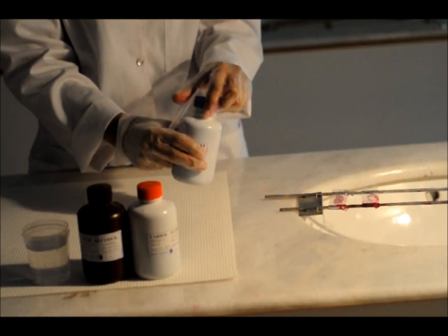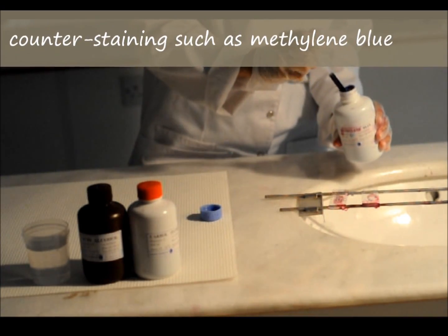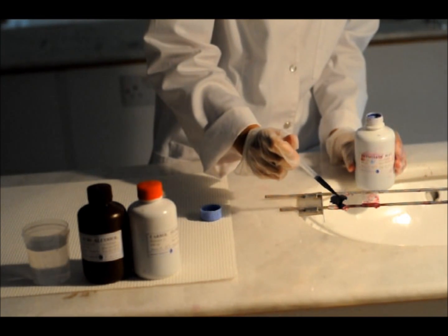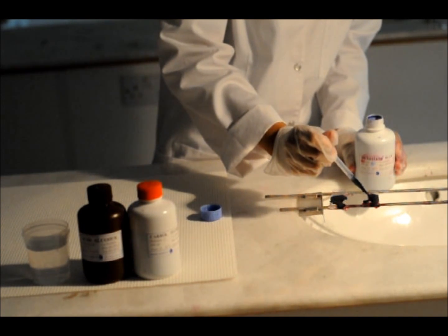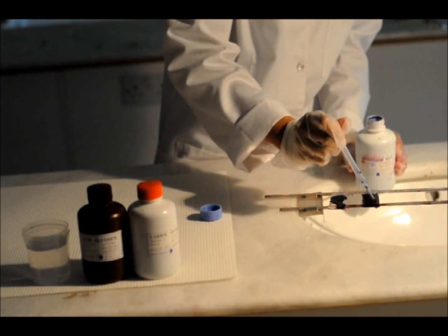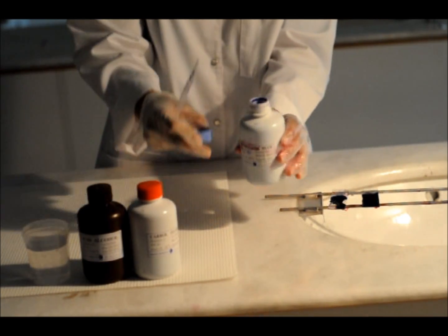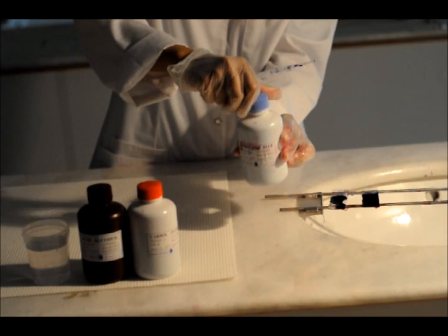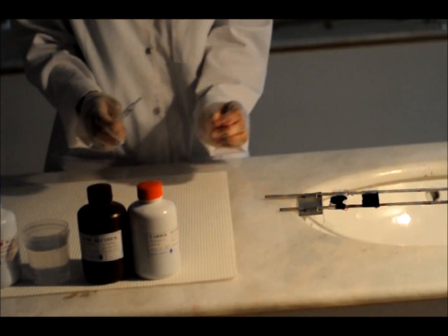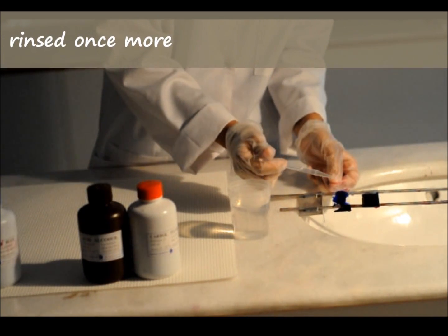The slide is placed for a short period of time in a counterstaining product such as methylene blue, providing contrast between background material and acid-fast structures. The slide is then rinsed once more.